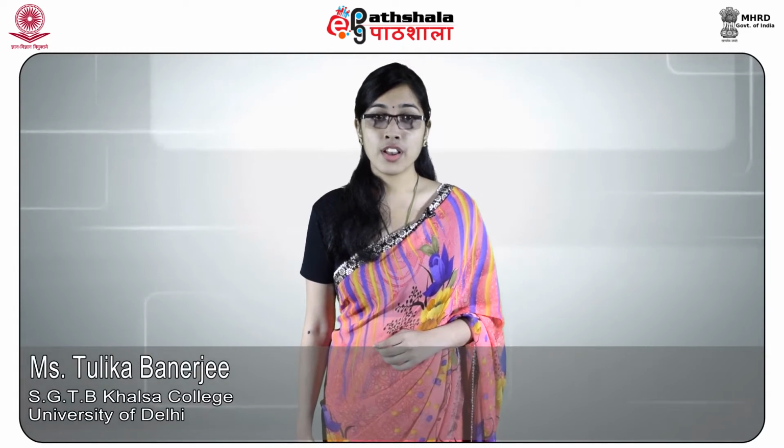Learning outcomes. After studying this module, you will be able to know about hair as evidence, and about the use of microscopy for hair examination.